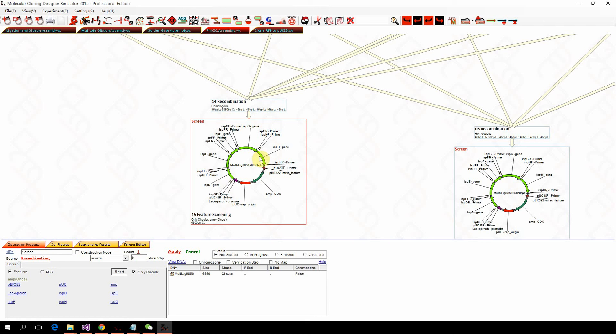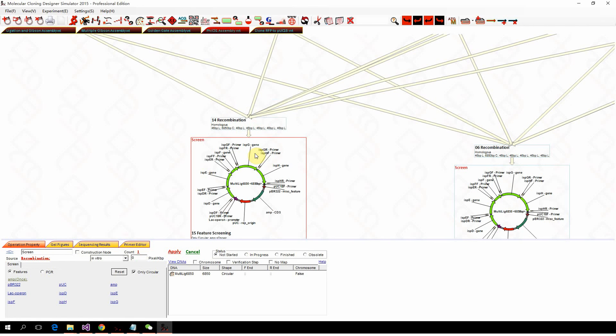Okay, that's how you can use Gibson assembly, ligation, and recombination to perform ligation, Gibson assembly, and even multiple fragment Gibson, Golden Gate, or PhiC31 site-specific recombination assembly. Thank you.